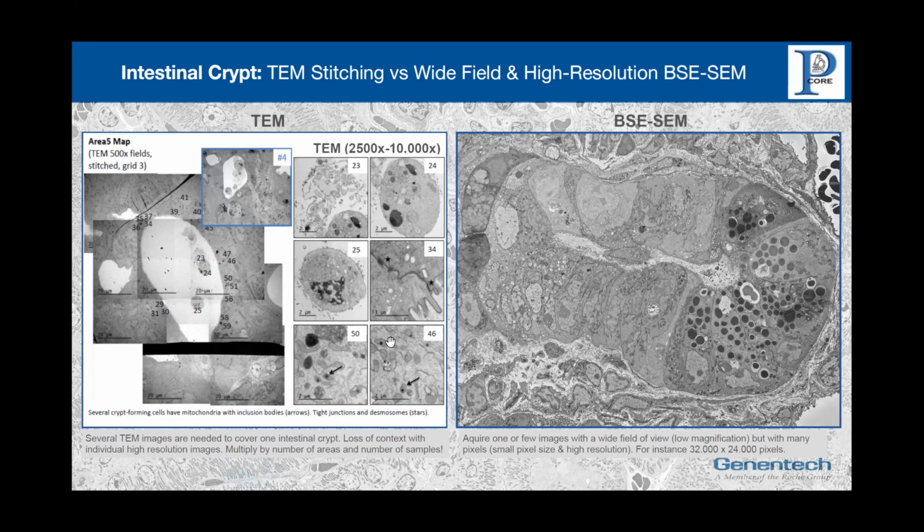Now, in order to understand where these individual images come from, it's often necessary to map them back so that our collaborators understand what we're imaging. And obviously, this also creates a lot of individual images. And if you now also consider that usually we do controlled studies with different dosings, so we may end up with 6, 12, or even more than 30 samples. And in each of these samples, we would photograph several regions with all these images, so you can very quickly get confused.